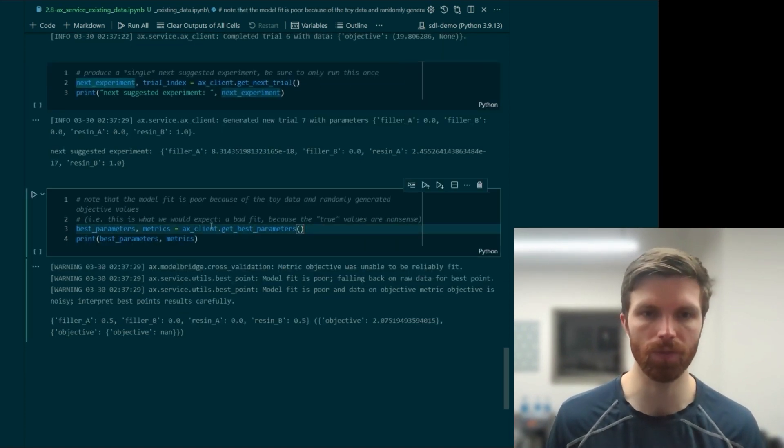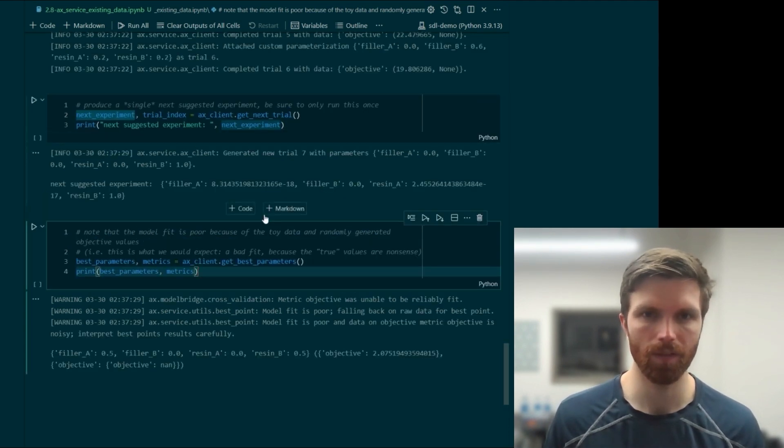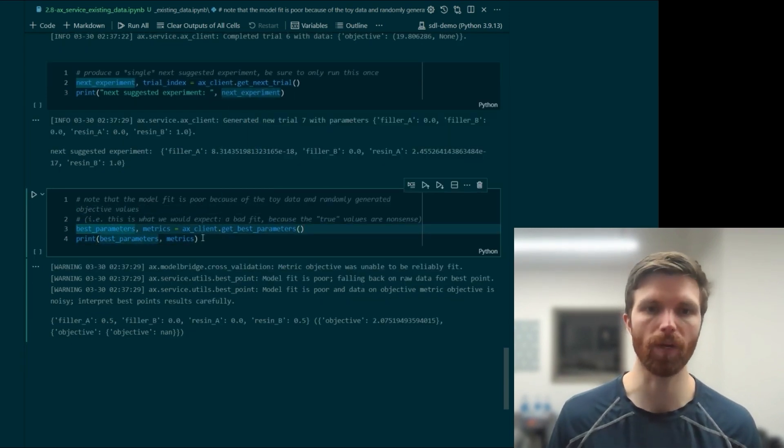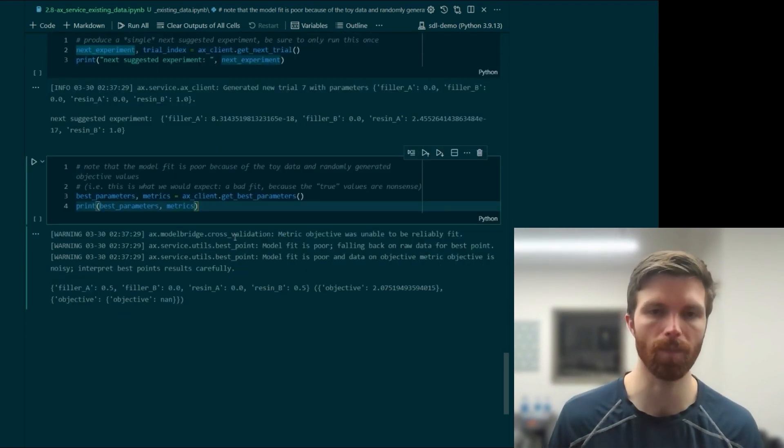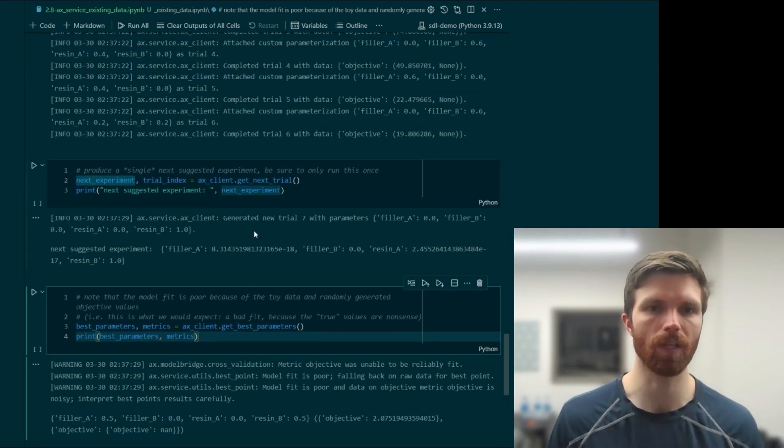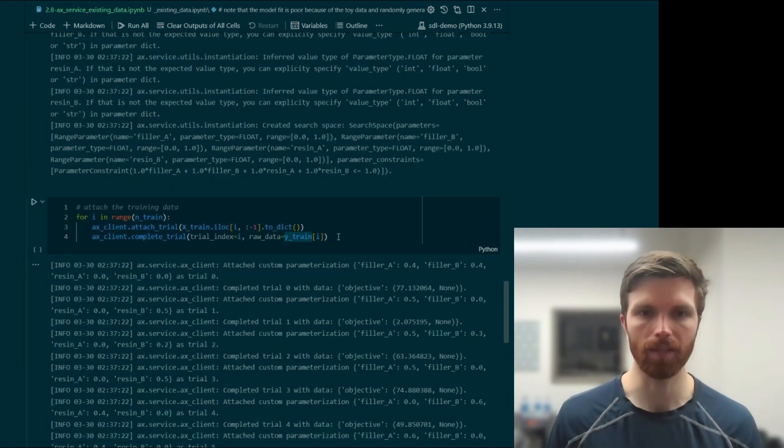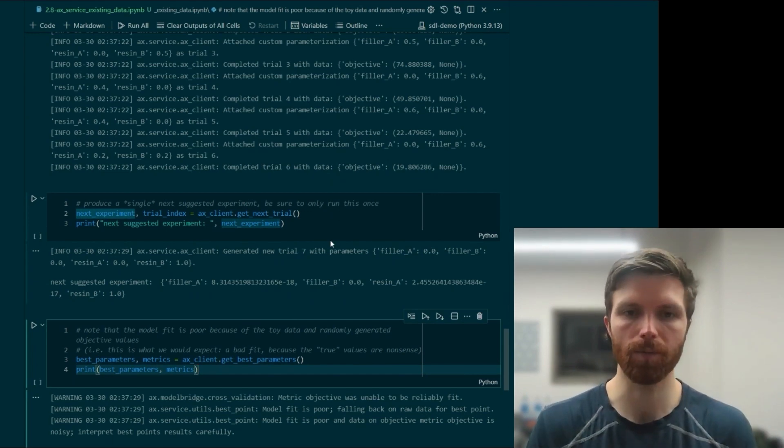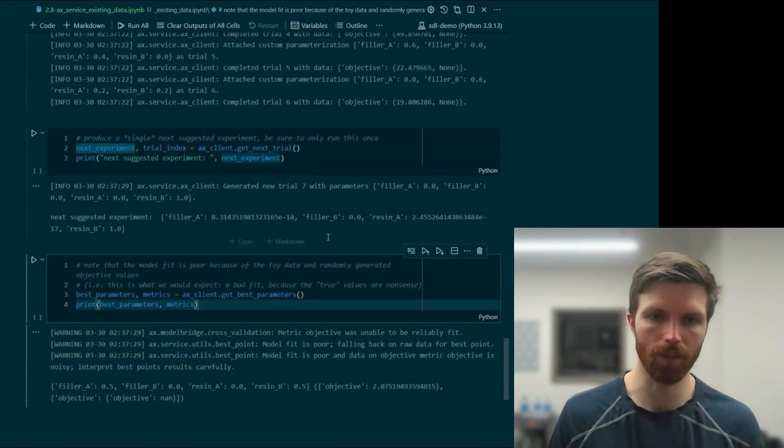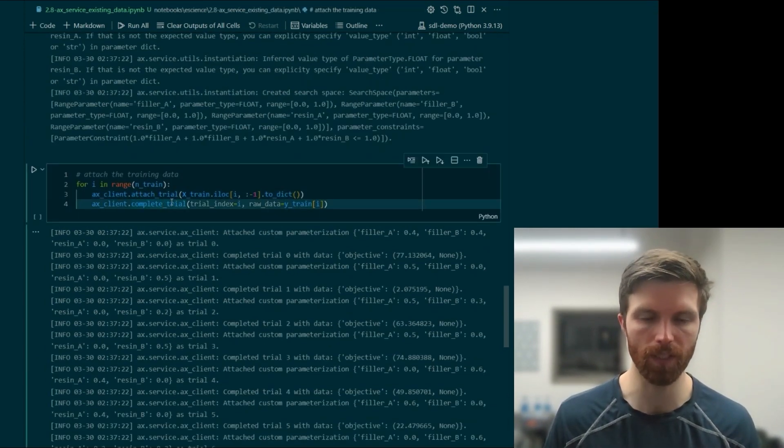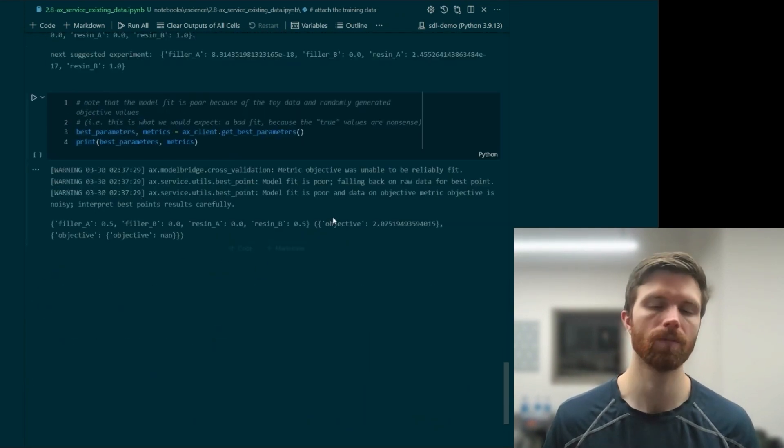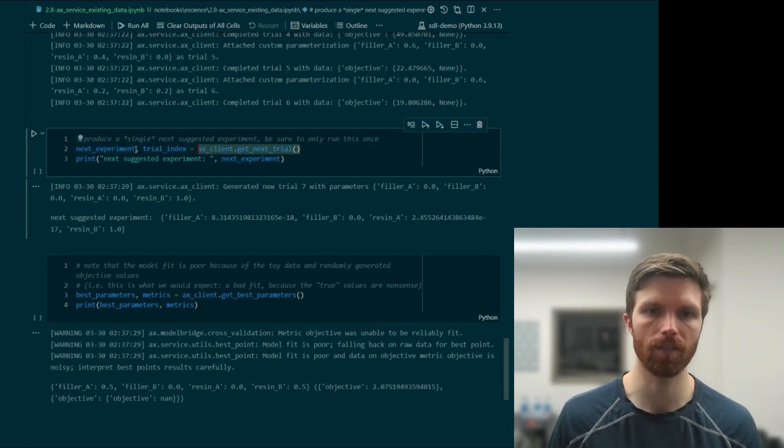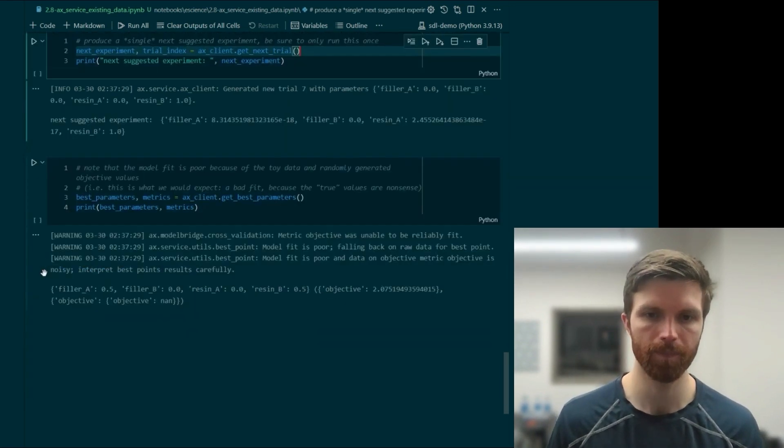We'll use this to find the best parameters predicted for the experiment so far out of everything that's been tried. So then at this point we can go back and go outside of the optimization framework, conduct the experiment, and then use this attach and complete trial interface in a new cell down below. Do that and then repeat the get next trial to get our next experiment to be run.